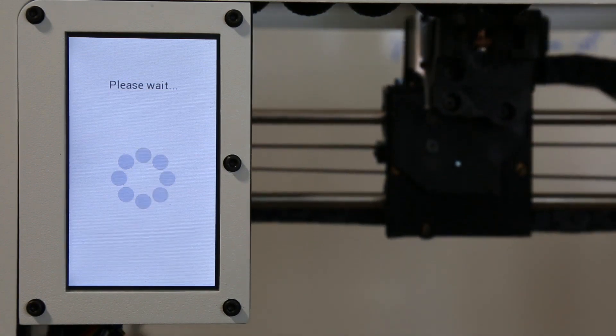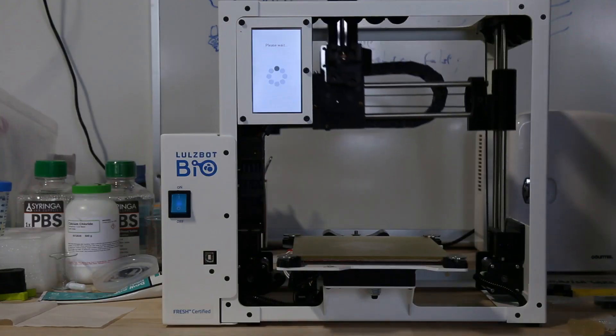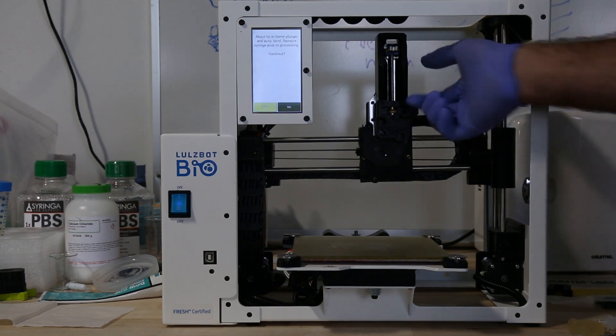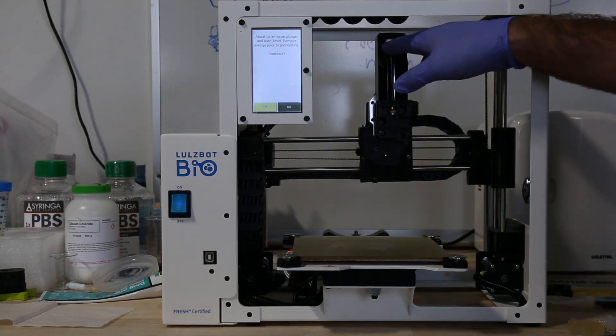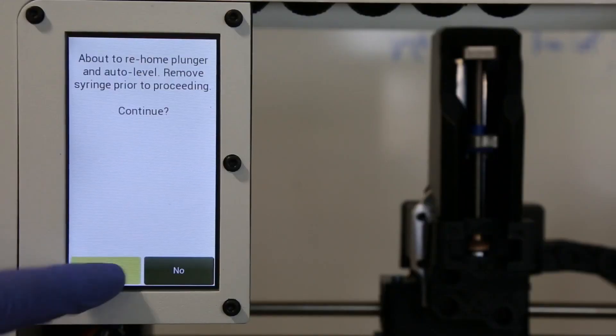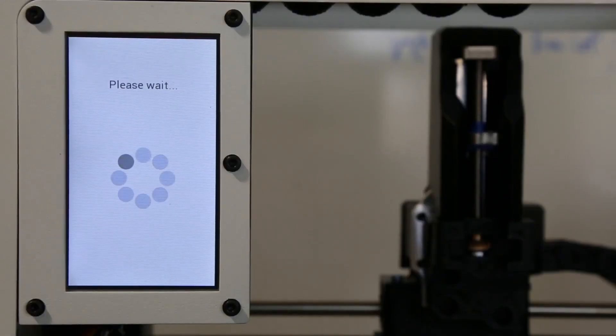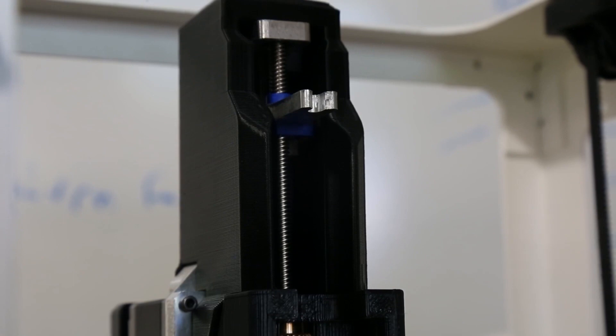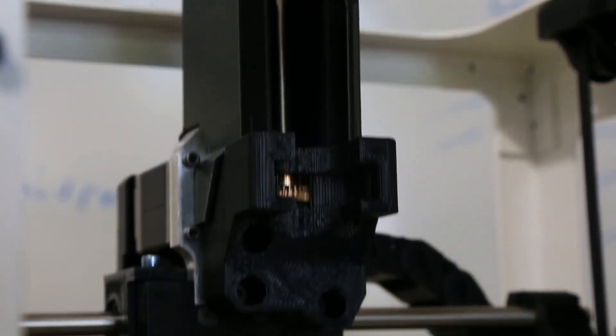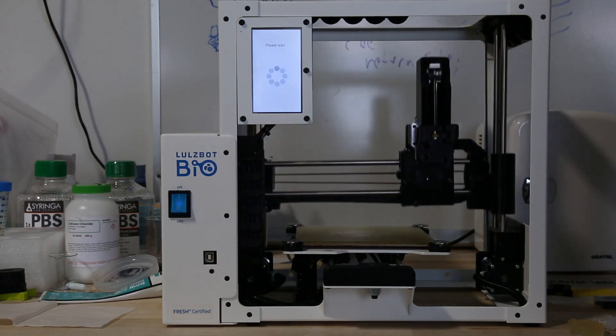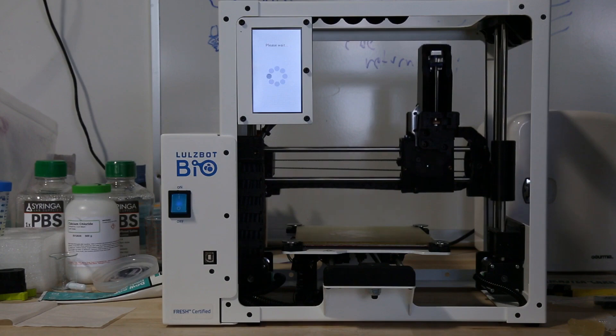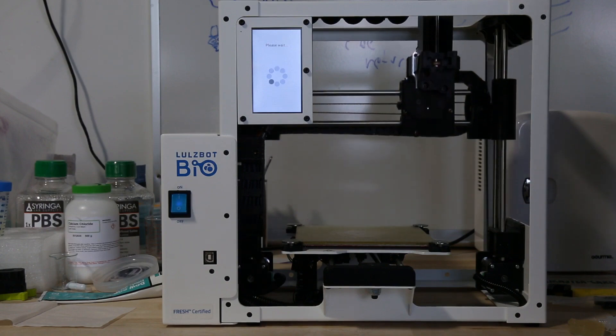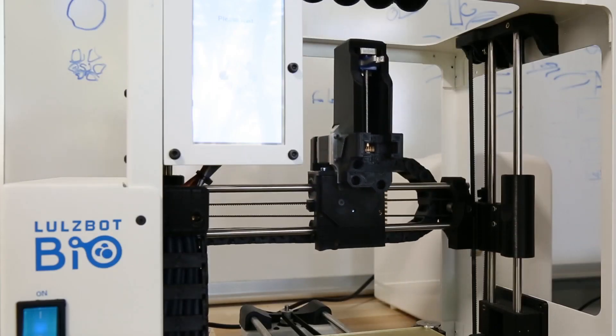And now the carriage is gonna move to the syringe unload or load position. Now if you had a syringe in here you would remove it. After that the machine is gonna level the X gantry and home the plunger to the top. And now the machine is gonna level the X gantry and move to the syringe load position.